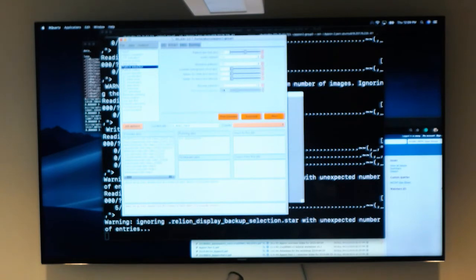Why I'm saying that is that's where I'm seeing most of our users. There was a user in Appion Part 1 for whom it's not a problem. They can get three angstrom reconstructions from their data set. Not informative. It's been solved by X-ray crystallography 20 years ago. So that's no value add. They're in a regime where they have to solve multiple reconstructions from a single sample to really push science forward, to see different conformations.